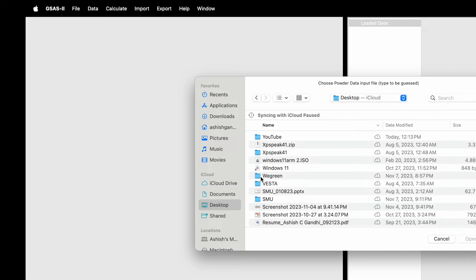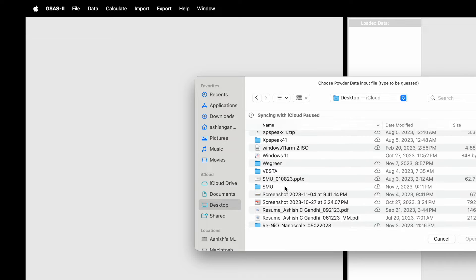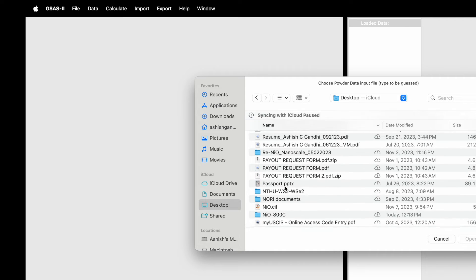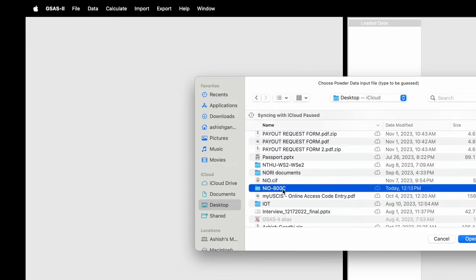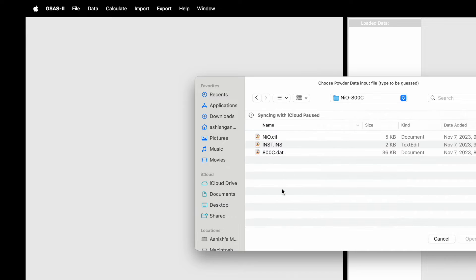Here I have saved data on my desktop, and we will consider the case of nickel oxide. In this folder you will see there are three different files: one is a CIF, another is the instrument file, and the third is the data. In this video I want to demonstrate how to perform detailed refinement if we don't have access to the instrument file.